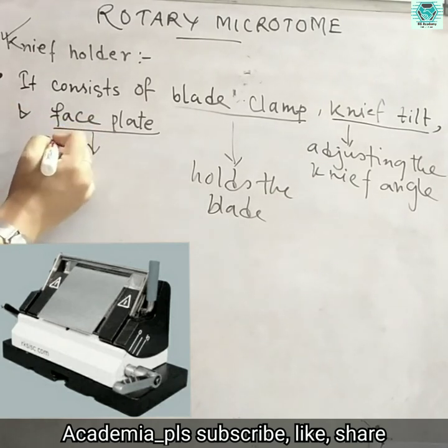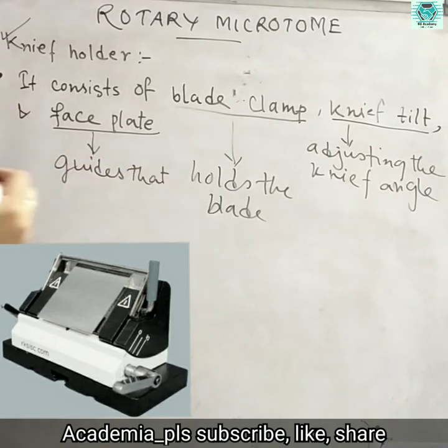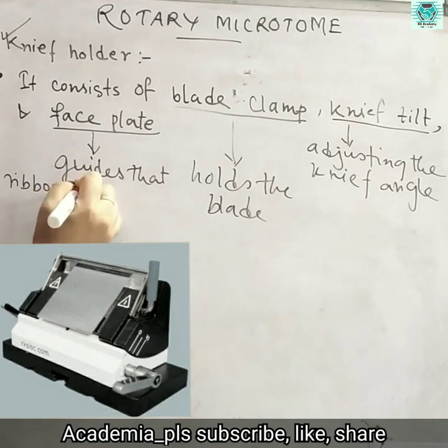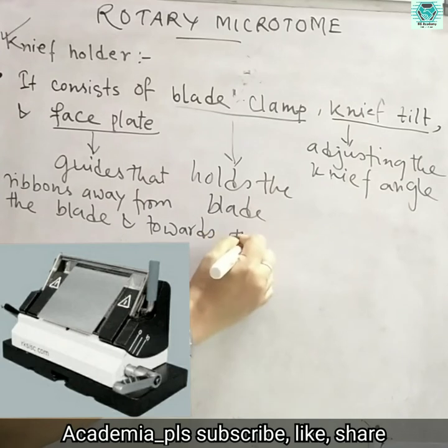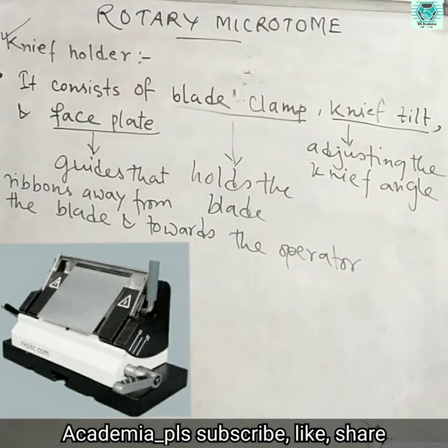It guides the ribbons, that is the section ribbons, towards the operator. So these are the three components with their functions.